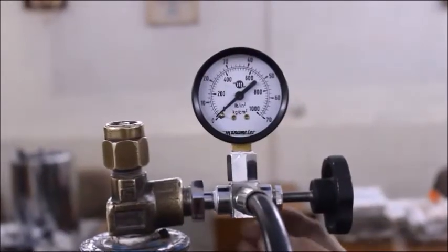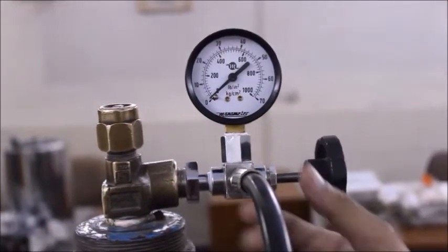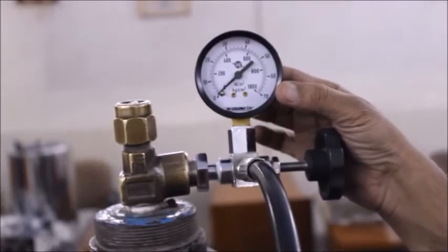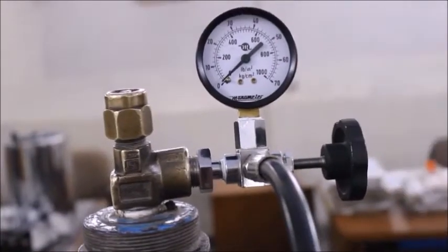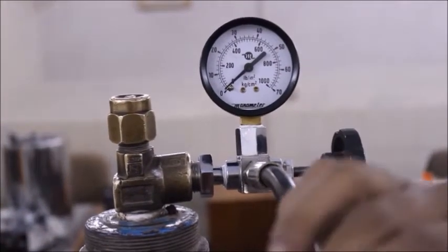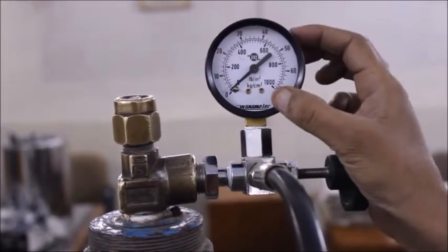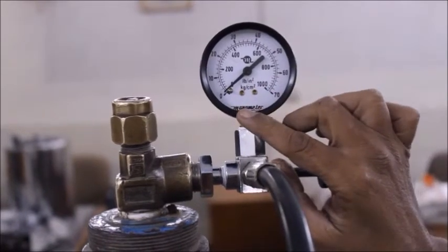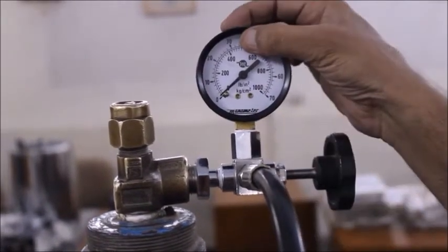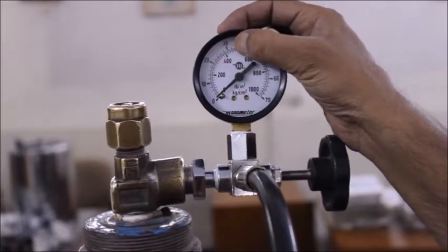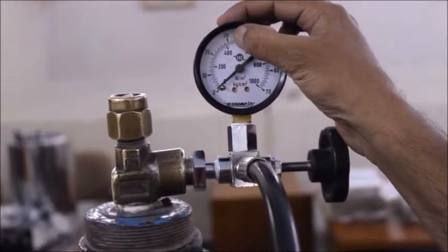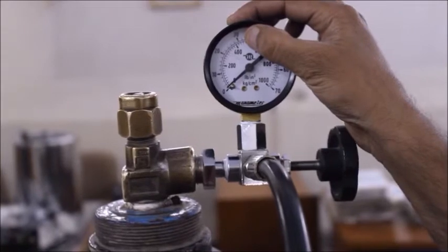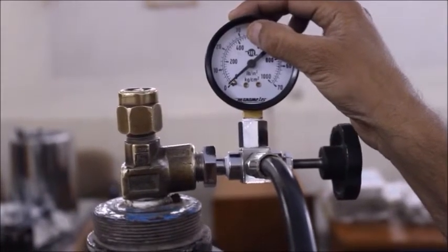We will now fill the combustion bomb with oxygen using the oxygen cylinder. This is the valve used to release oxygen attached to an oxygen gas pipe. This dial is the pressure gauge and we must make sure that the pressure does not exceed 30 kgs per cm2. The pressure inside the combustion bomb should be maintained at 30 kg per cm2.